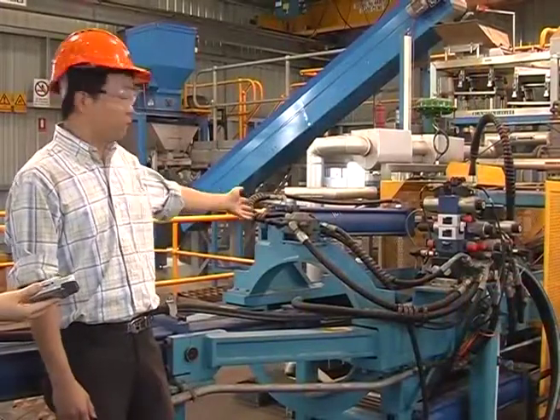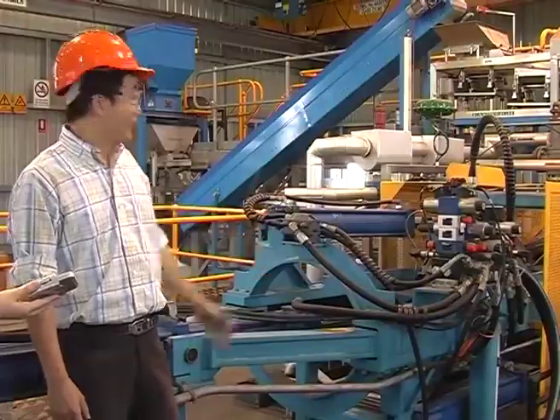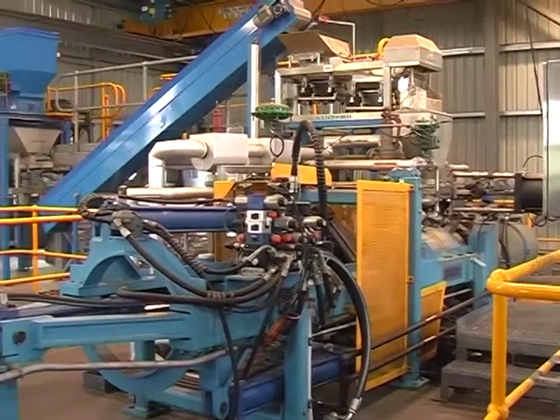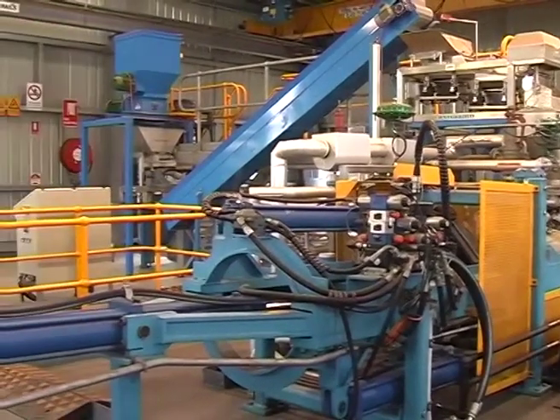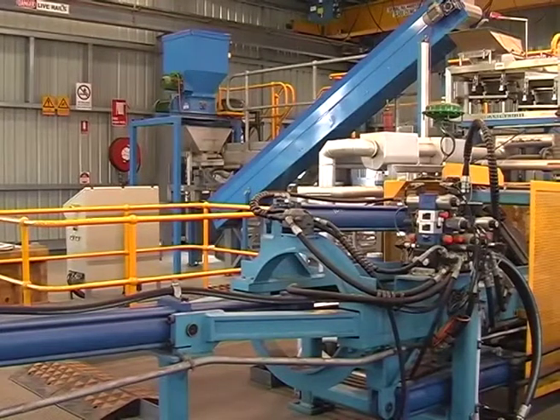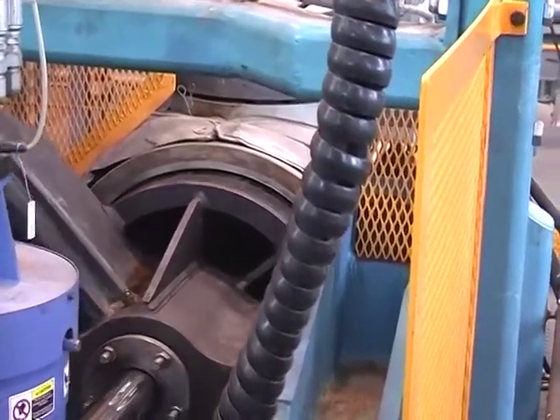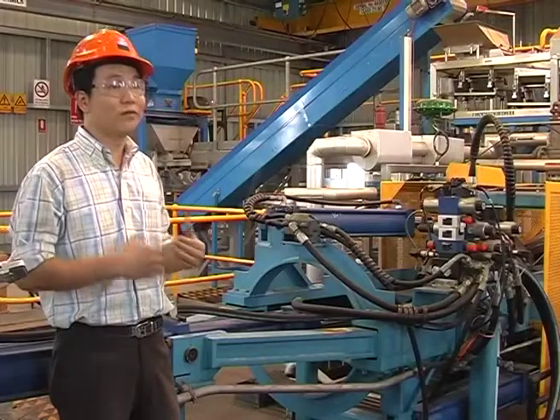This is our pre-treatment reactor. That's where we put steam and chemicals inside this reactor for the pre-treatment. There's a stirrer and a chamber. This reactor is made of Hastelloy so that we can use it for different chemicals and strong acid or base for the pre-treatment.